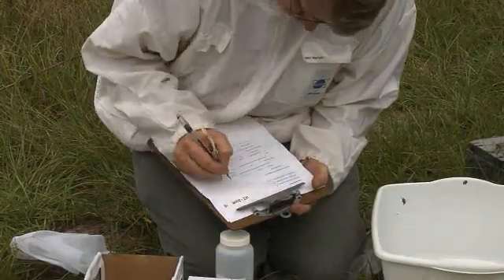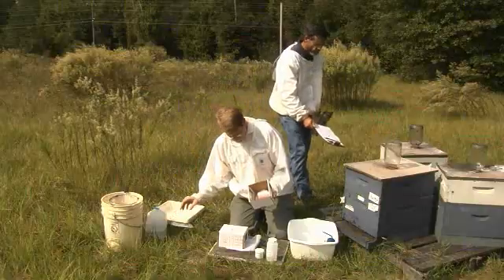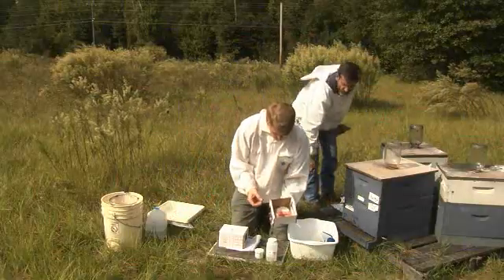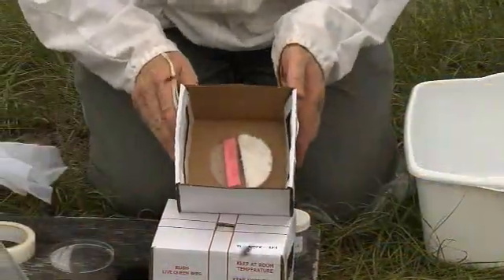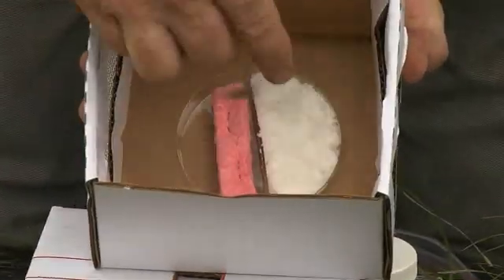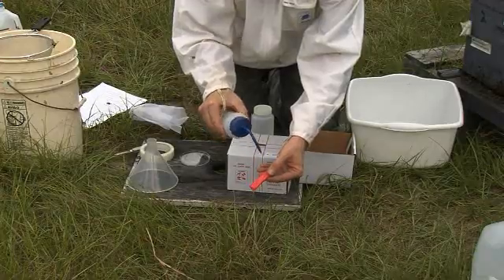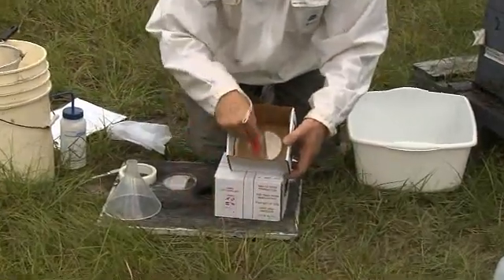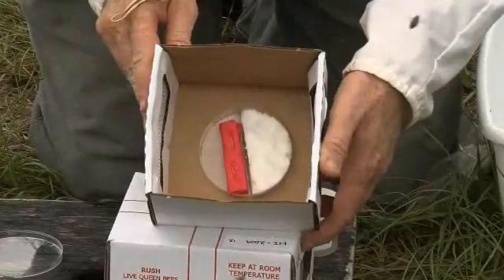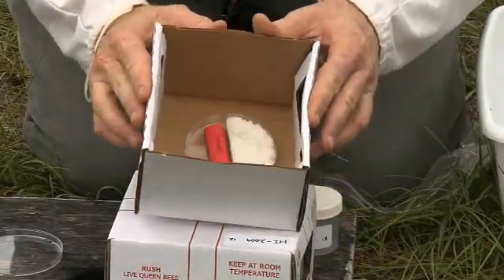Fill out the data information sheet — this includes the beekeeper's contact information, apiary location, and date of sample collection. Now set up the sampling equipment. First, remove the petri dish lid that is covering the queen candy glued to the floor of the box. There may be a piece of wax paper covering the candy, which should also be removed. Next, soak the sponge in water and place it in the second half of the petri dish. The water and queen candy will provide nourishment as the bees are being shipped from the apiary to the lab.